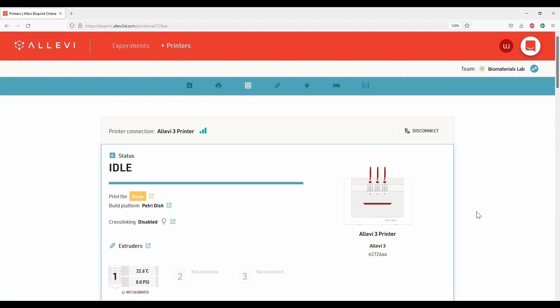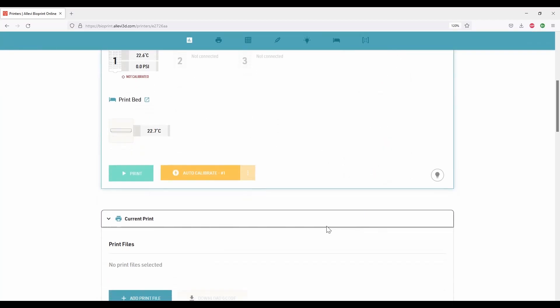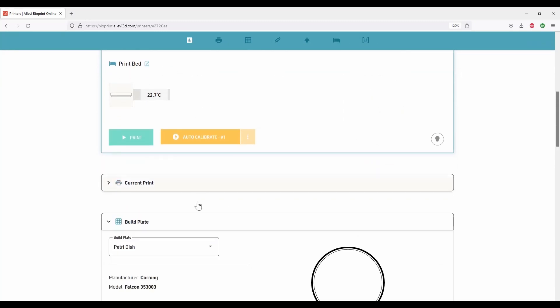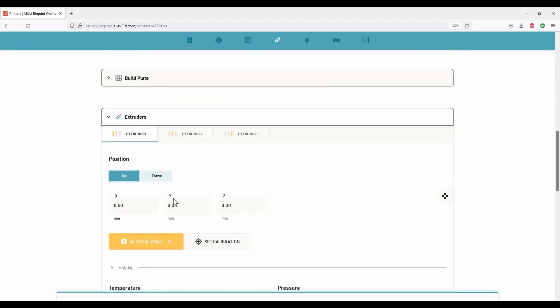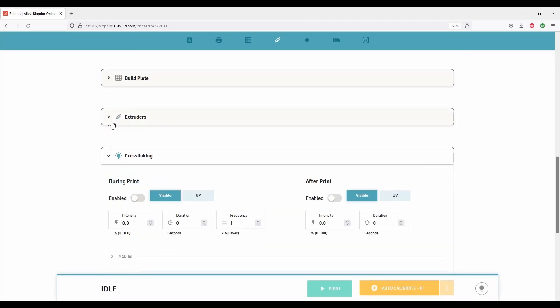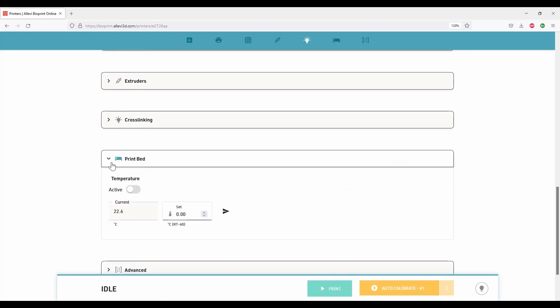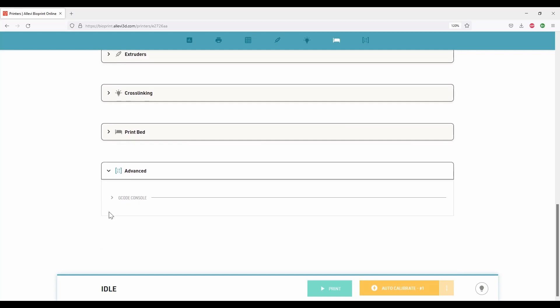We have different sections with various settings. The first section is the printer status followed by print file, build plate, extruders, cross-linking, print pad, and advanced. G-code commands can be entered in the advanced section. Please do not use this unless you are an expert in G-code.